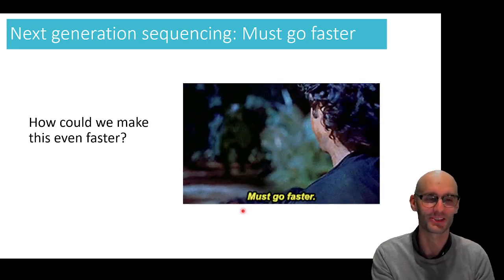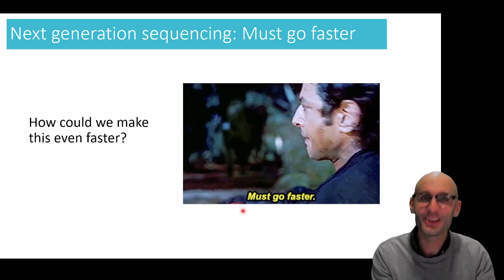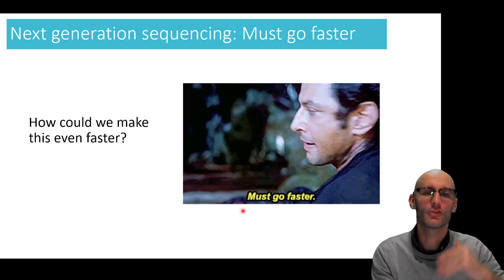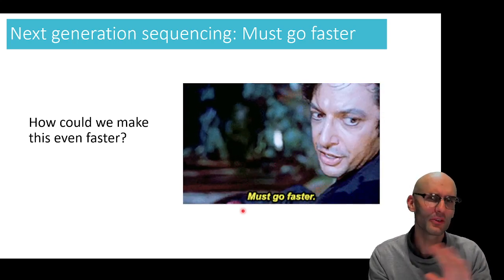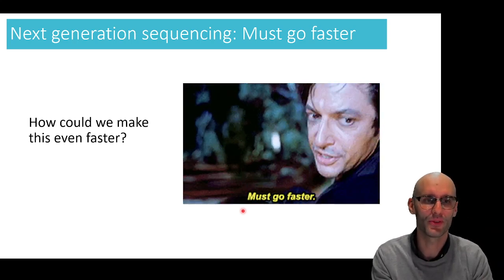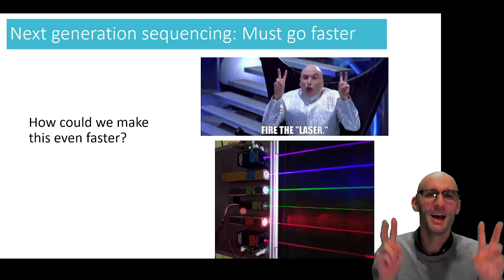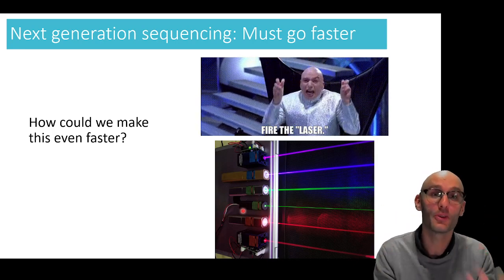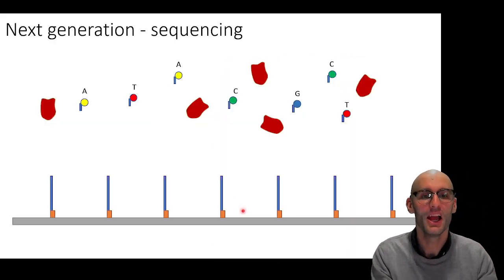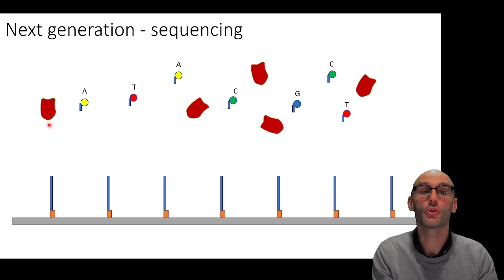Anyway, must go faster. This technique feels a bit slow, right? One nucleotide at a time across all the fragments. Admittedly, the fragments are normally about 70 nucleotides long, so it only takes maybe 70 cycles to get through them. But how do we do it faster? And the answer is, this is another 90s film, more lasers. We need more colors, and with more colored lasers, we can do more nucleotides at a time. So here we can see the A's are yellow, the T's are red, the C's are green, and the G's are blue. So now we can do it all in one step.